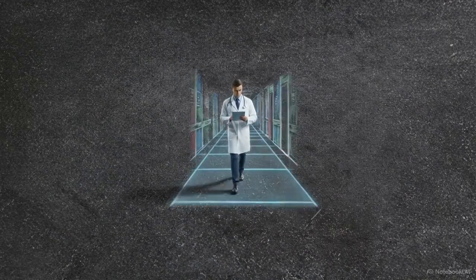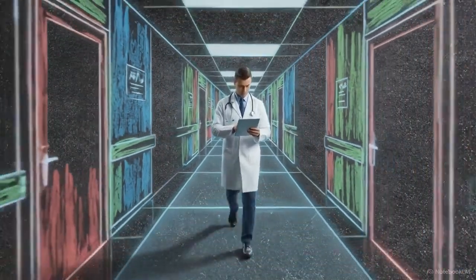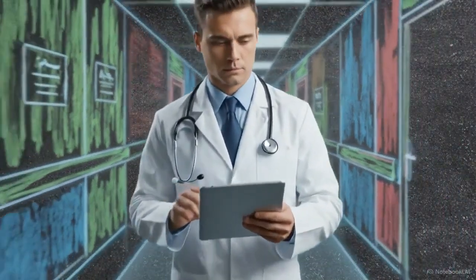The careful synthesis of optical spectroscopy, rigorous signal processing, and specialized AI successfully transforms raw biophysical noise into actionable, life-saving diagnostic data.